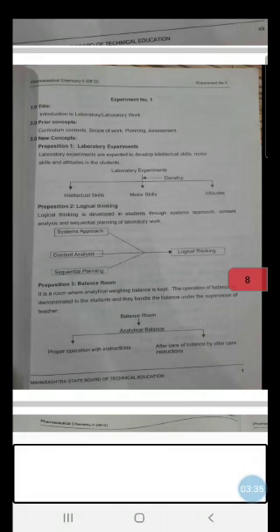These analytical balances are essential for accurate weighing, particularly in quantitative analysis or quantitative practicals, or where weight carries a major importance. Now, in this room, there is one chart hanging on the wall. This chart contains a number of instructions which you must follow for accurate weighing and smooth working of your balance.